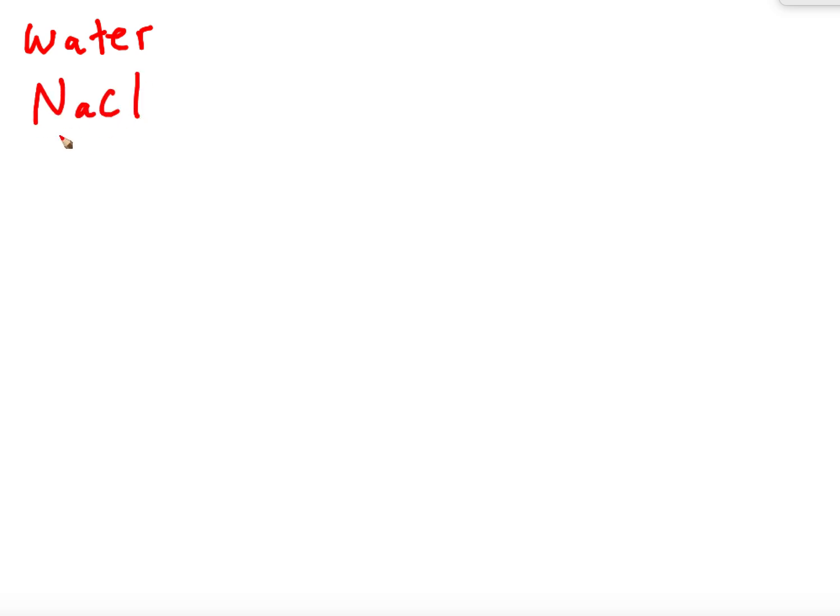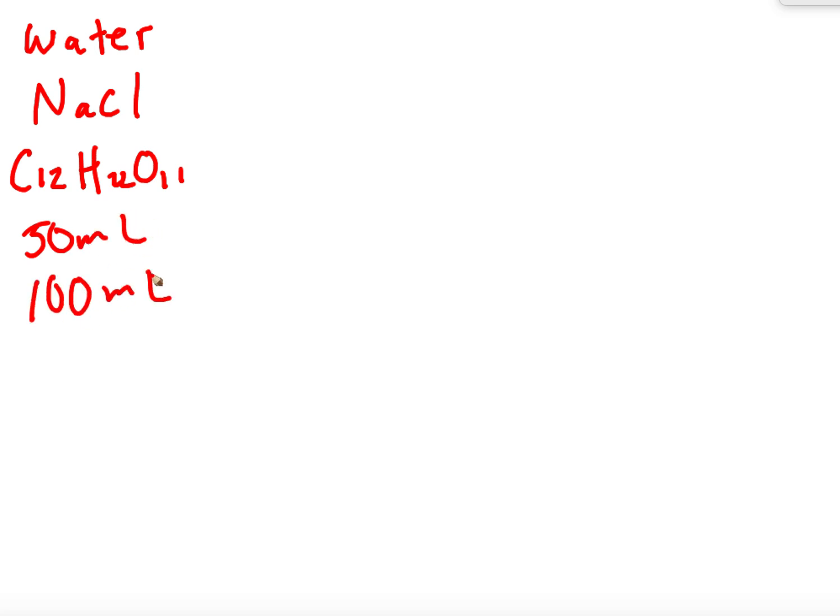The purpose of this is for you to learn how to prepare molar solutions. In your materials, we're going to have water, NaCl, and sucrose, which we know is C12H22O11. We're going to have a 50 milliliter, 100 milliliter, and 1 liter flask. And these are all volumetric flasks.